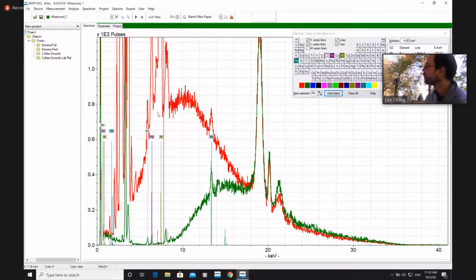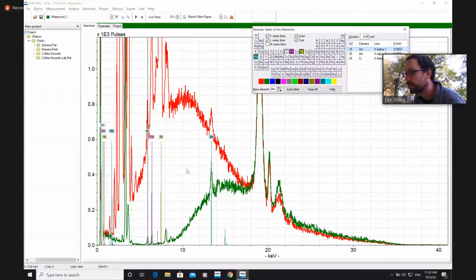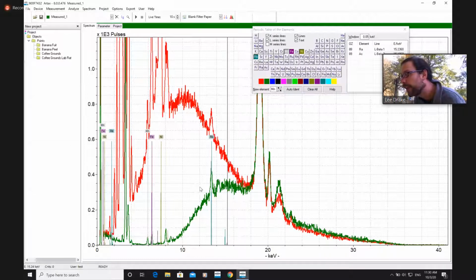That's another one of the problems with using the lab rat mode, is when we do a lab rat mode, we see all the atoms around us, including the atoms that make up the instrument itself. We can't avoid that. If we could make an antimatter XRF, we'd go for it. But unfortunately, we can't. We have to compromise. And so there have to be some metals present in the instrument. We get around that by using filters to really minimize that impact. So that's good. And we can now see the iron and the manganese that is present in very small quantities. If you look here, you can see that our rubidium peak is much better.